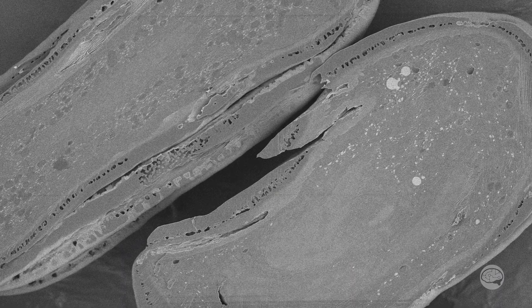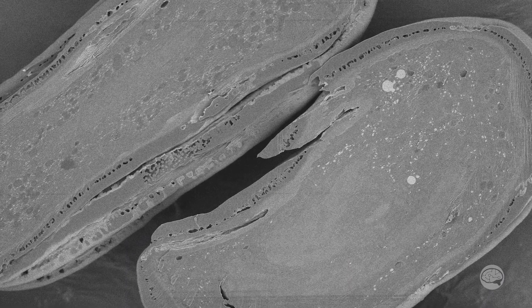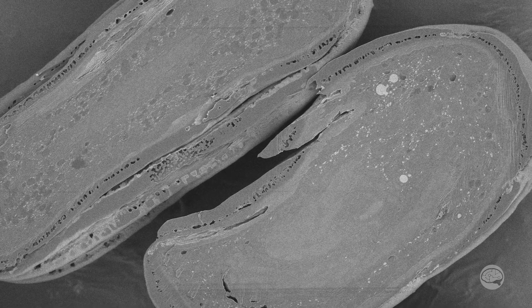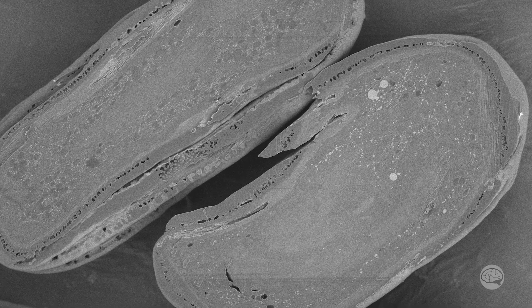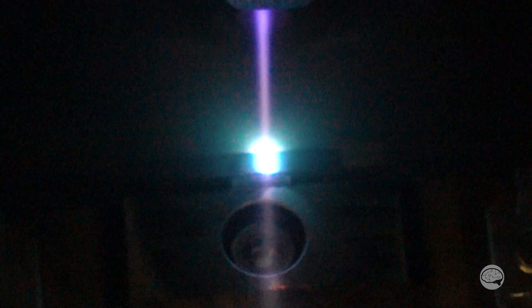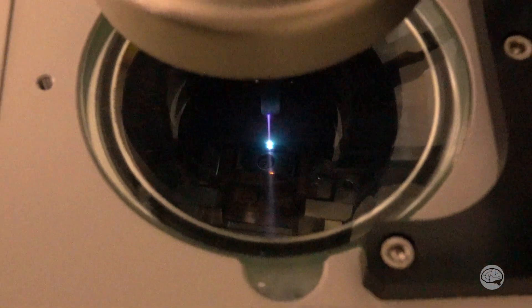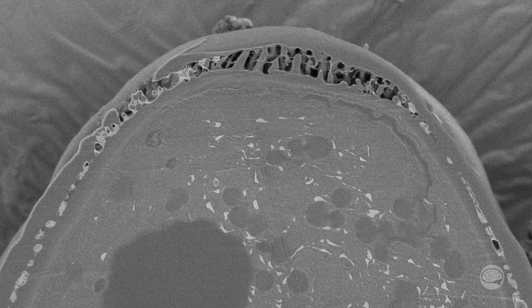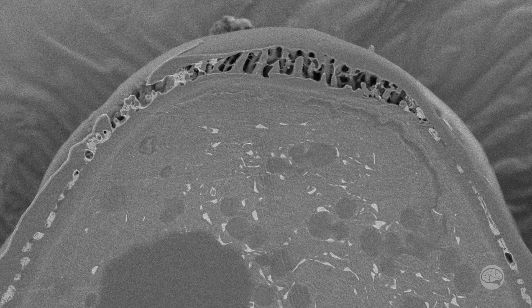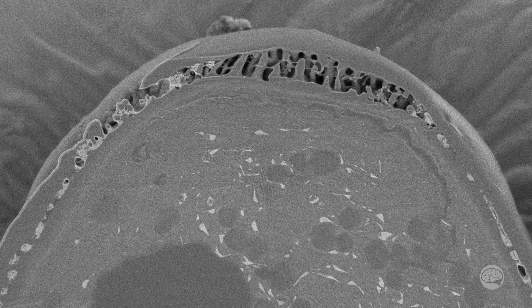Anyway, this is something that I just did on a lark. I didn't know if this would be interesting to literally anyone anywhere at any time. But I just thought it was kind of an interesting project to do with the broad ion beam milling system — to show you some of the crazy things you can do with it. And I believe now that the broad ion beam milling system is an indispensable tool in modern SEM work. So tell me what you guys think — do you have a broad ion beam milling system in your lab? What do you want to see me mill through next? Let me know about it in the comments.